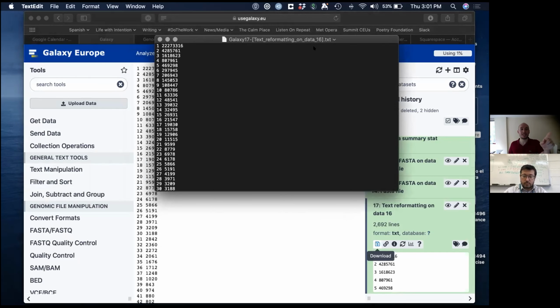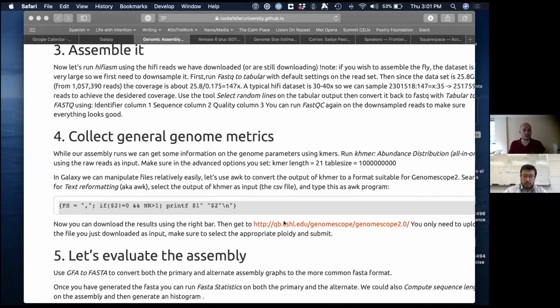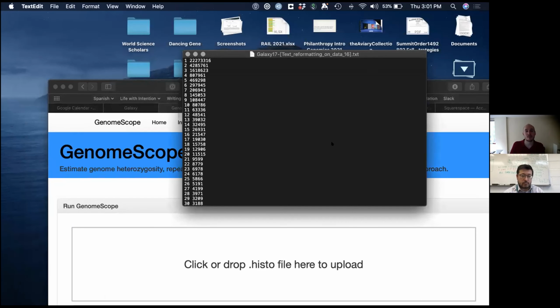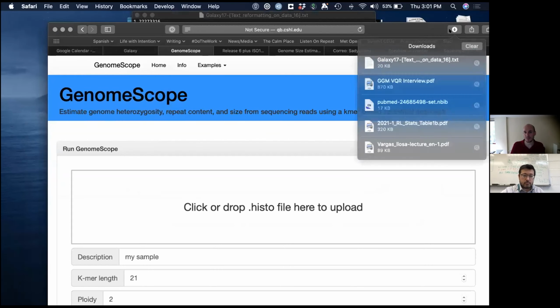If you connect now, I didn't do this step, so if someone else already did it, it's super fast. So just go ahead and drag and drop the file wherever it is. It's in your downloads maybe.